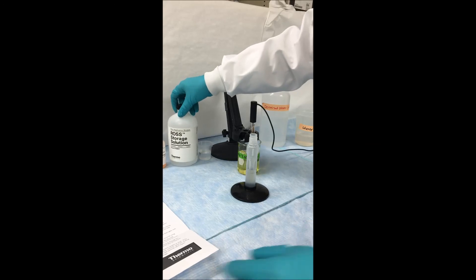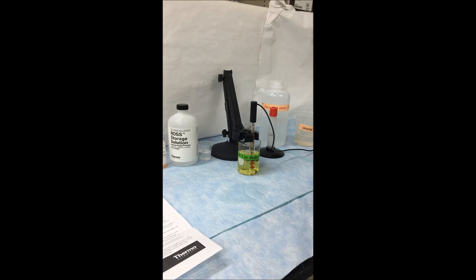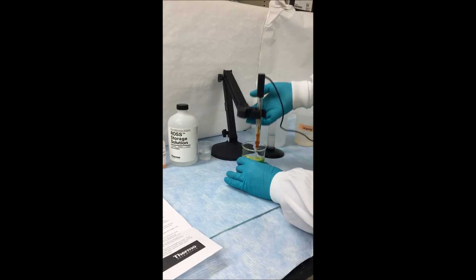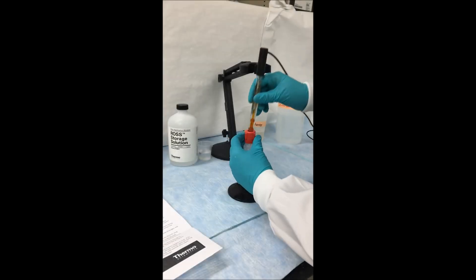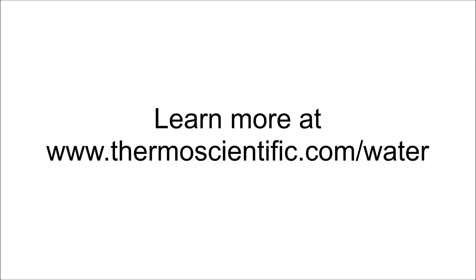It is good practice to change your storage solution every time you clean your electrode. Once that hour is up, you can go ahead and start using your electrode to measure samples or return it to the clean storage solution container until the next time you need to use it.